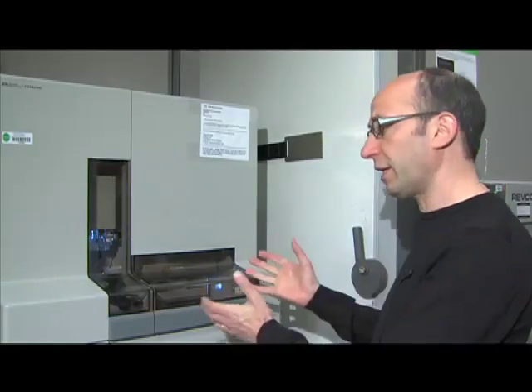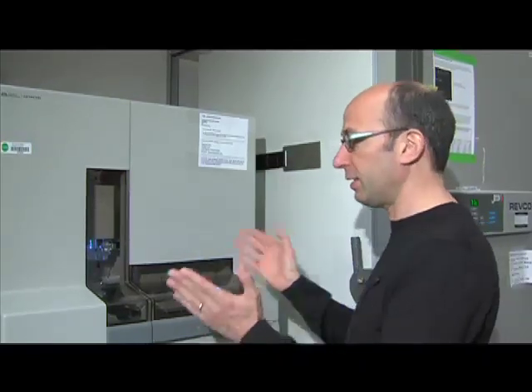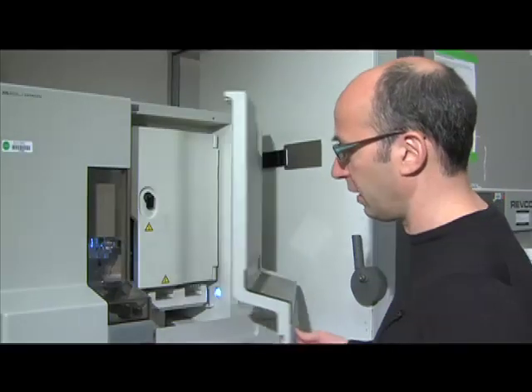Here we have a capillary electrophoresis-based system for doing Sanger sequencing. And very much like the gels I talked about, you analyze a dideoxy termination reaction by separating the pieces of DNA based on their size. But instead of looking at radioactivity, we're going to be looking at fluorescence colors indicating the sequence.